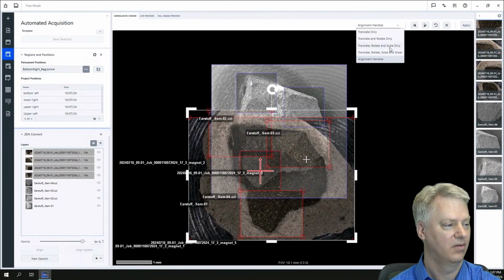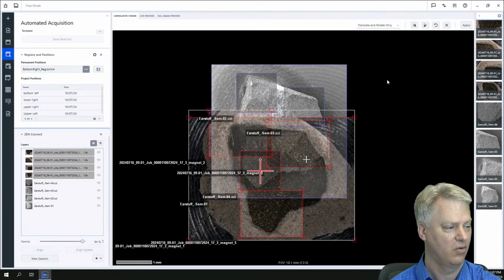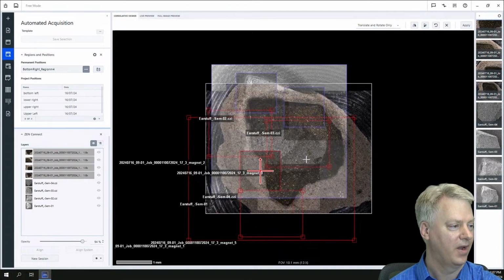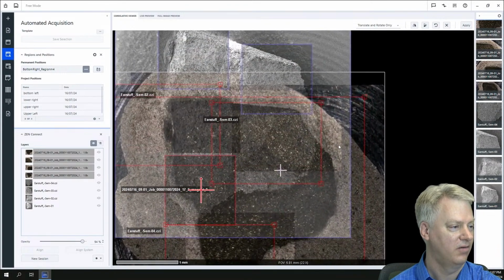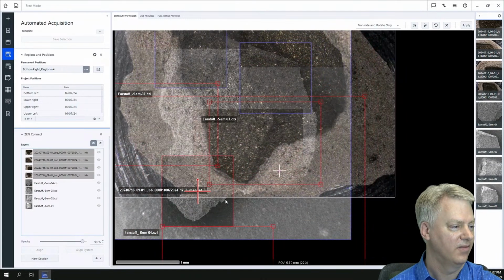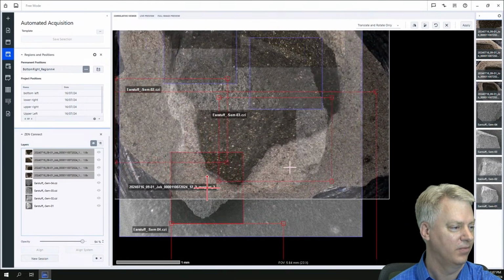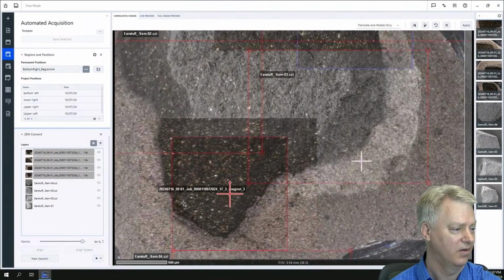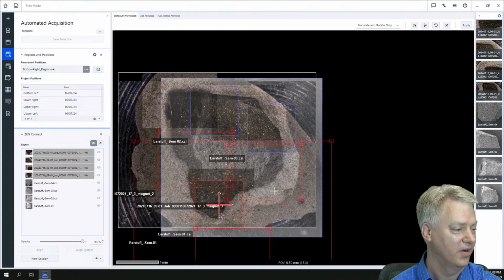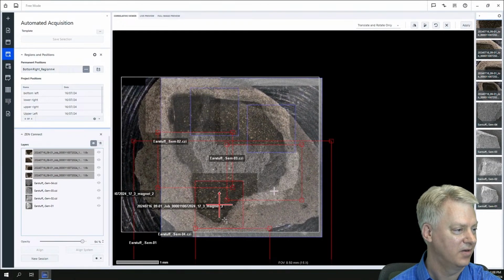Just to demonstrate what we're going to do here, though, is to pull in a ZEISS LM image, and all of the LM images are correlated to each other. So they're scaled and they're placed with respect to each other. And I'm just moving around all of them all at once on top of the SEM image, and I'm identifying the shape here at the bottom. It's like the bottom of Africa, the African continent here, trying to line it up at the bottom, and then I'll put a pin down there because I can tell that it needs to be rotated.